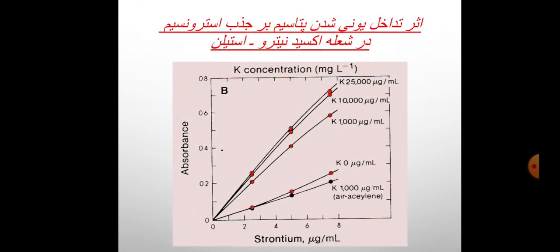In the next picture, you can see this effect. This is the absorbance of strontium as a function of strontium concentration.